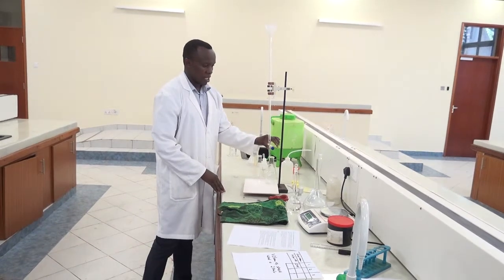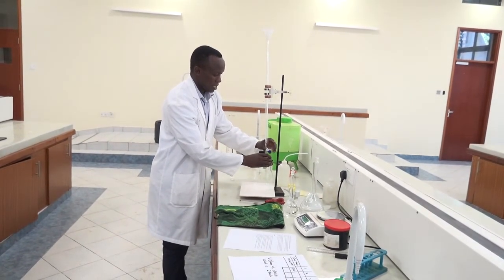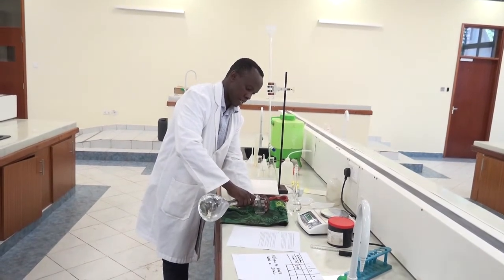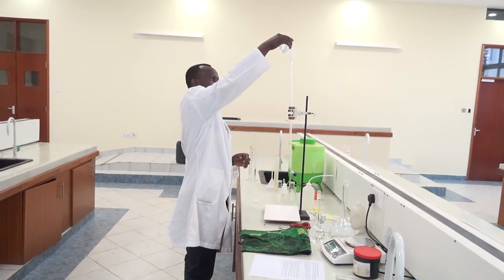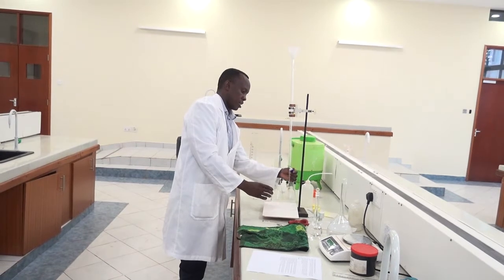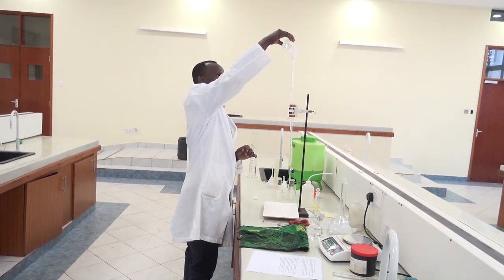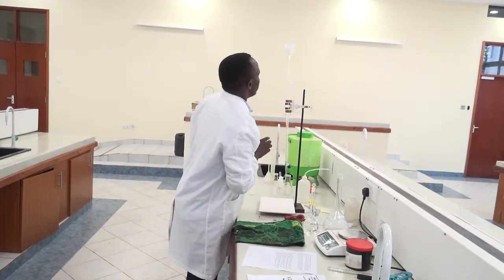After I have rinsed it with the solution, I'm now ready to fill my burette with the HCl. Take a small amount of it in a beaker and fill my burette. Make sure that the tap is not open. You fill it past the zero mark.